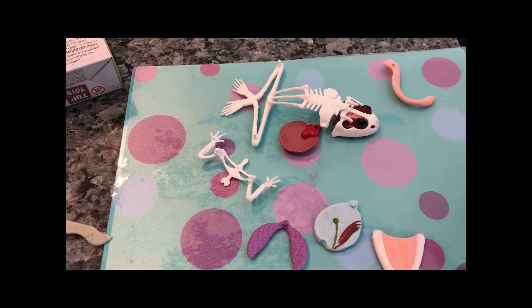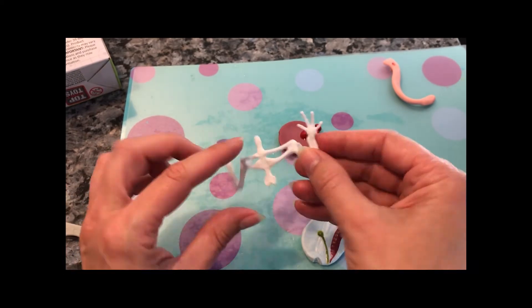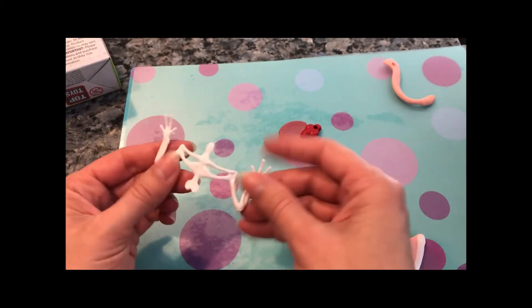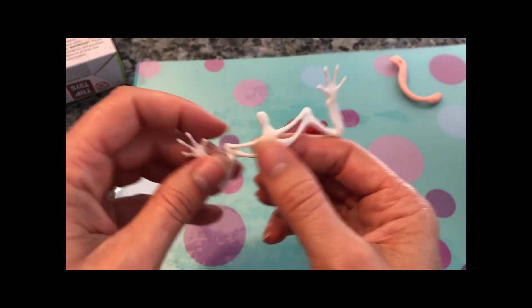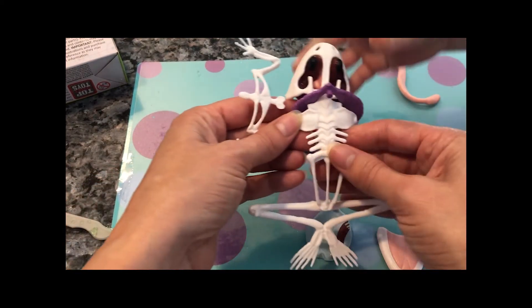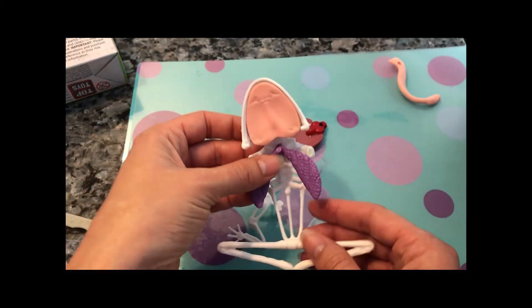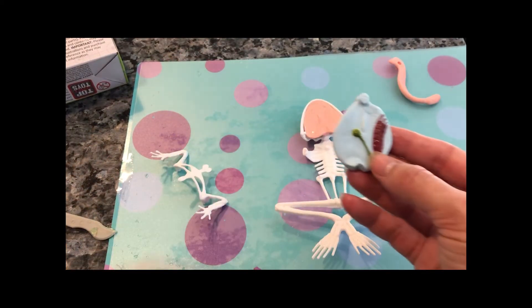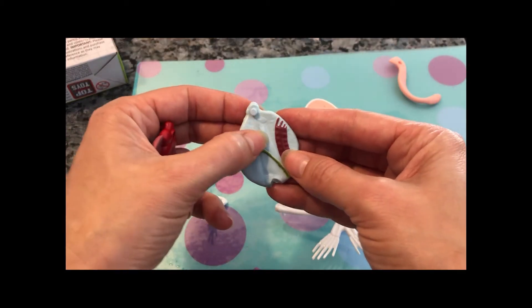Maybe we should start with the bones. So they have a lot of the same kinds of bones that we have, like we have bones for our arms and our hands, and we have a rib cage that protects our lungs. So these lungs would probably be on the inside. Do we remember what this one is? Gallbladder, pancreas, and spleen.